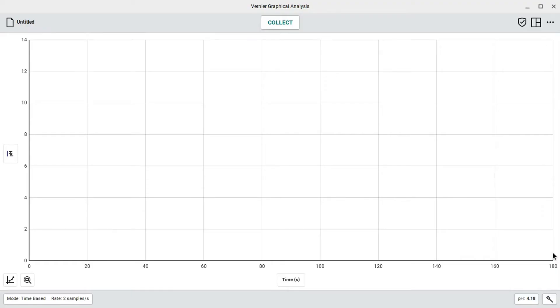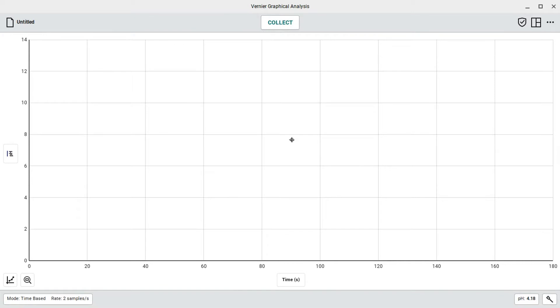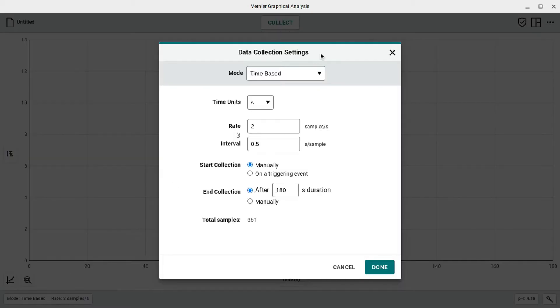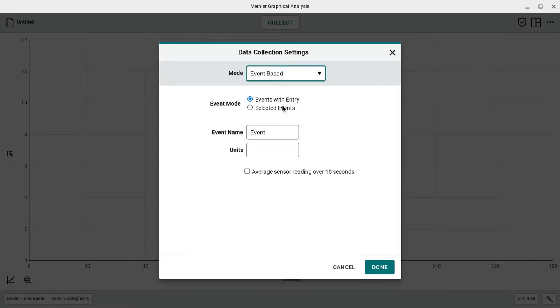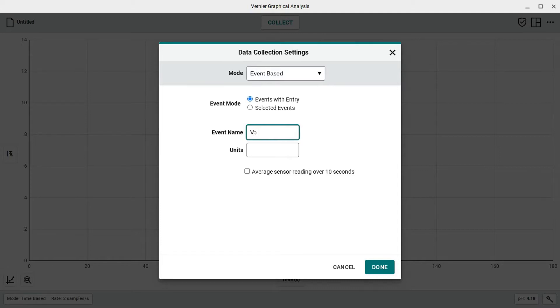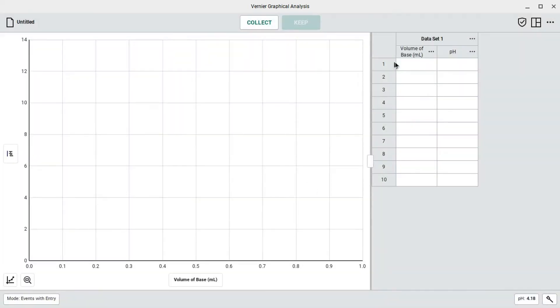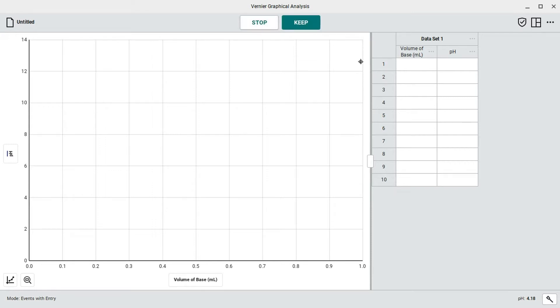You'll also want to set up graphical analysis here for a pH probe. You can see our pH probe is plugged in. But what we're going to need is we're going to set this up so that we can collect the data properly. We're going to go ahead and change the mode here to event based. We want our event name to be volume of the base, and the units are going to be milliliters. So we're going to record values for the amount of base that we've added and the pH level that it's currently reading. Here we can go ahead and click the collect button.